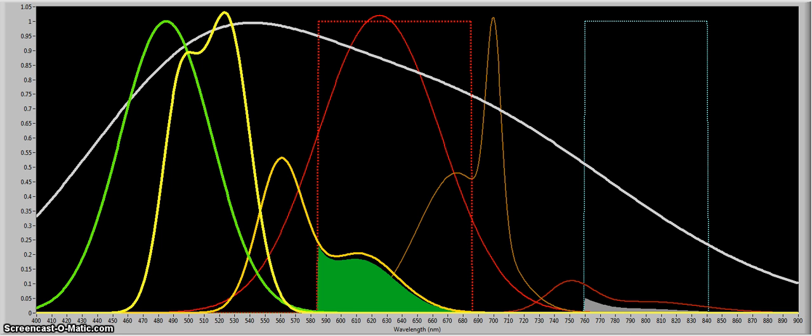We're now looking at the full ensemble of signals that needed to be convoluted to understand the ramifications of the difference in the fluorescence and the various other componentry that we've spoken about. The net impact is that we see our green signal is substantially larger than our red signal here in the gray, and that's going to have ramifications for how we design our system.